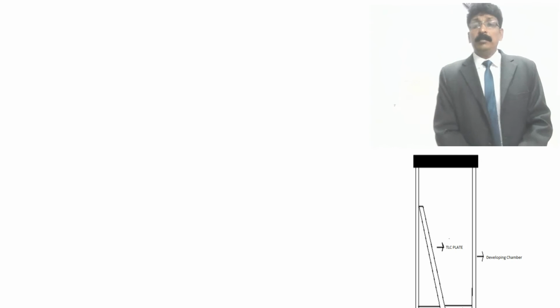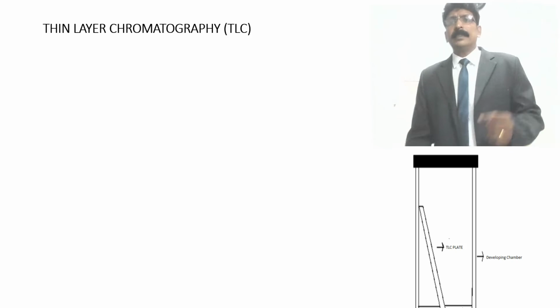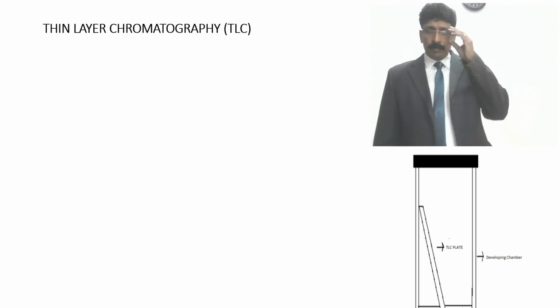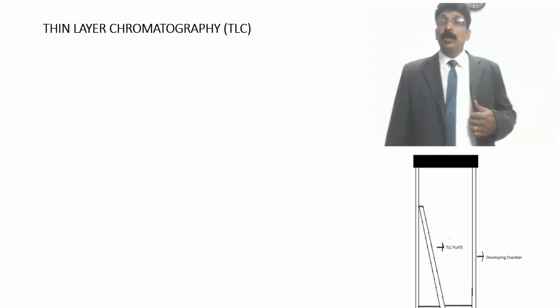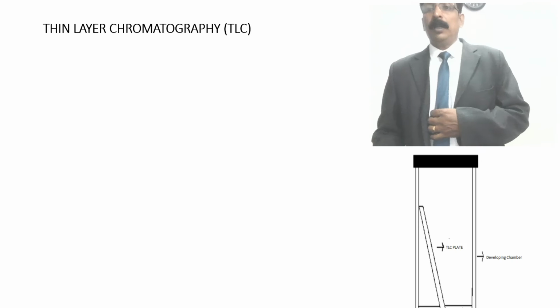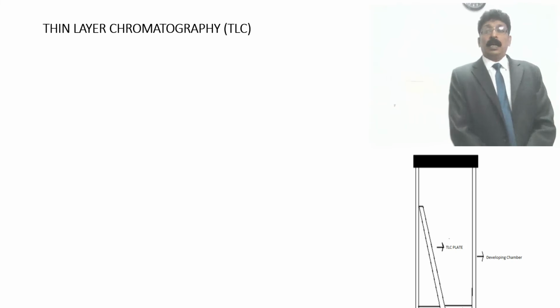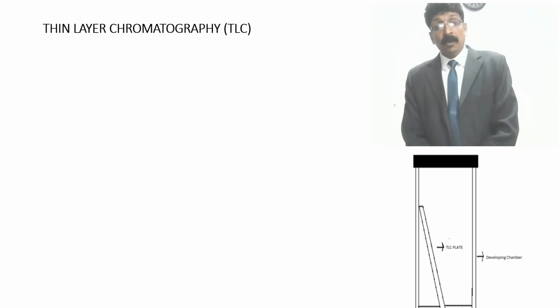Thin layer chromatography is a very interesting and important experiment, and also a very important technique which is used for isolation of compound, identification, even qualitative and quantitative tests.